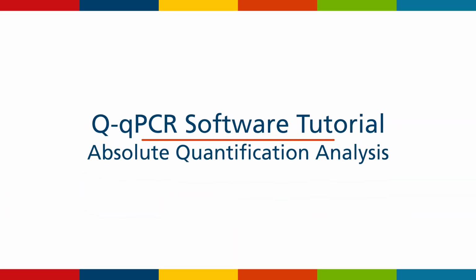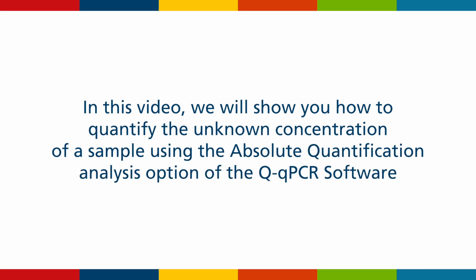Q-qPCR software tutorial, Absolute Quantification Analysis. In this video, we will show you how to quantify the unknown concentration of a sample using the Absolute Quantification Analysis option of the Q-qPCR software.